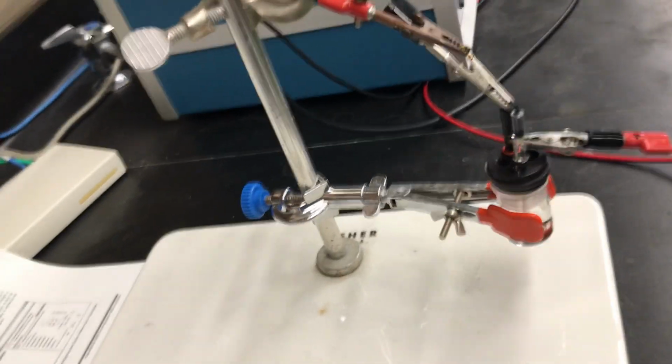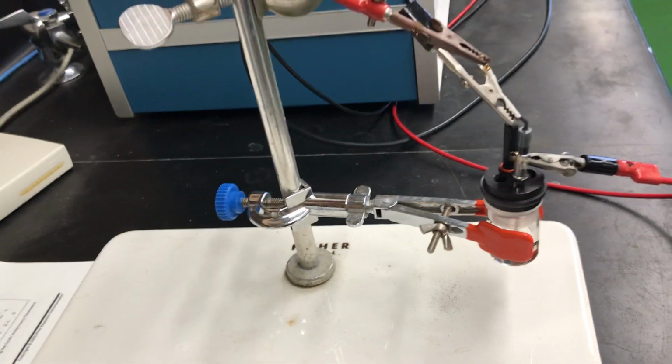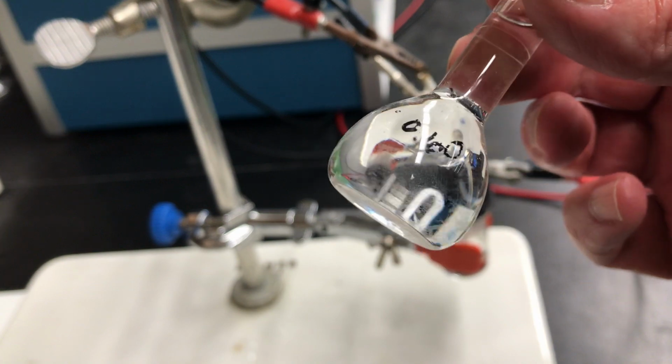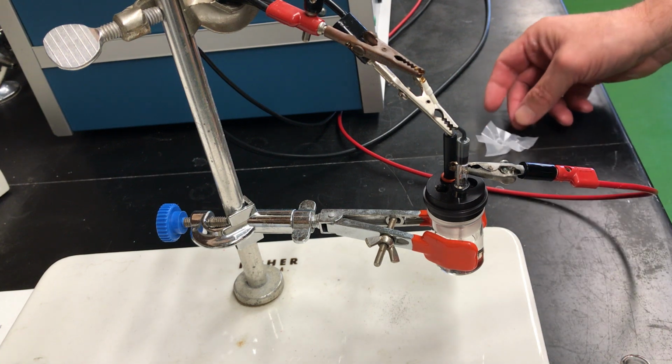Let's see if I can get my tripod right. Replace the buffer solution that I have there with a solution that actually contains some acetaminophen. All right, so I actually have a solution of acetaminophen that I generated from the stock solution that was in the lab. And this would be the same solution that you would be using to make up your standards.